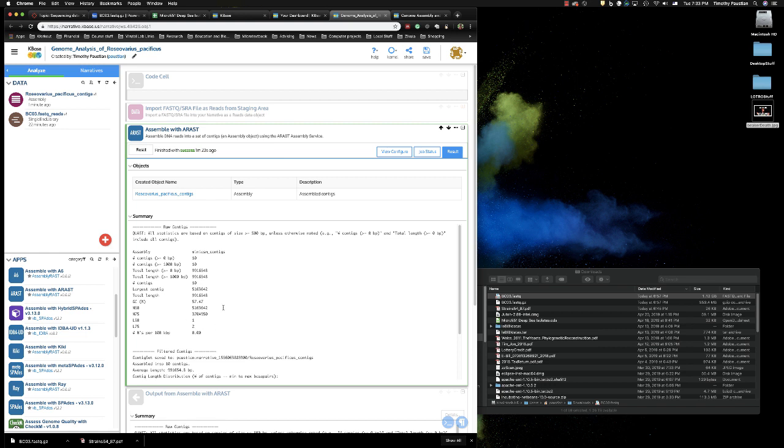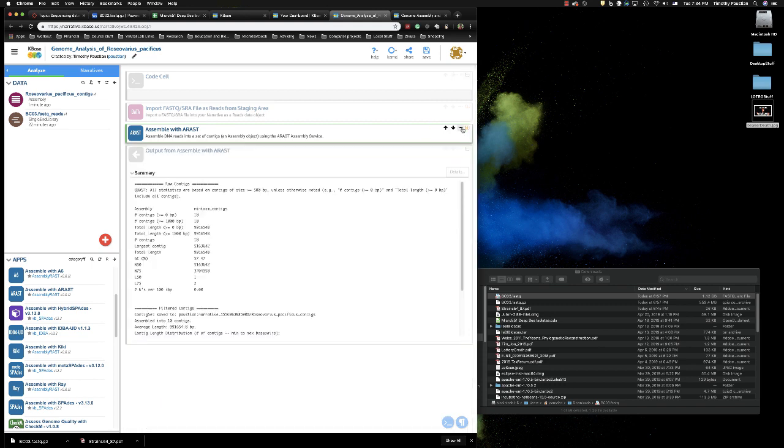If we look at the largest contig, it's 5 million base pairs. So the size of E. coli genome. If you look at the total length, it's saying it's a little bit under 10 megabases. So that's about double the size of an E. coli genome. Seems reasonable. It will be interesting to compare this to other Roseovarius assembled sequences, to see if it's about the same size. So we've got that data.